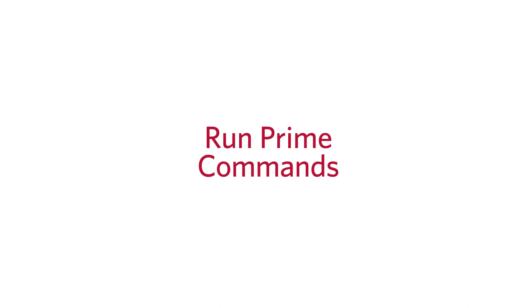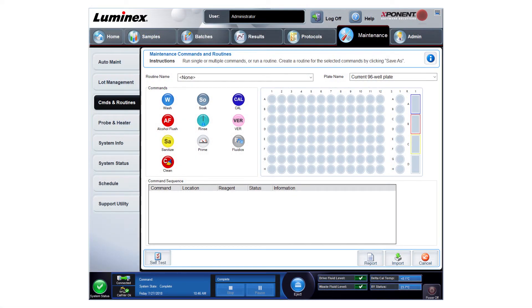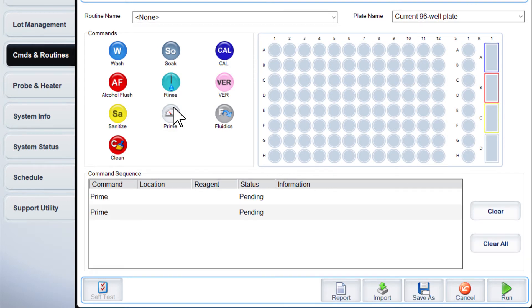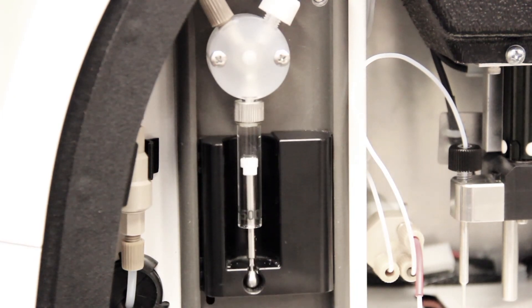Finally, prime the system before use. Plug in and turn on the MAGPIX. Using Exponent software, go to the Maintenance page, Commands and Routines tab, and run two prime commands. Ensure that drive fluid is being pulled into the syringe during the prime.